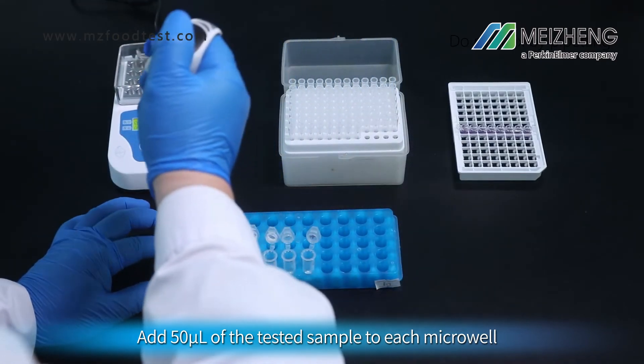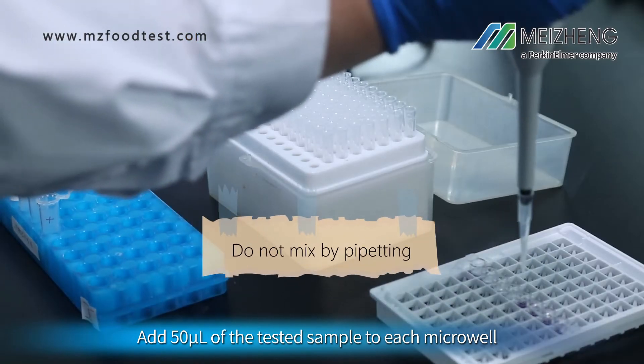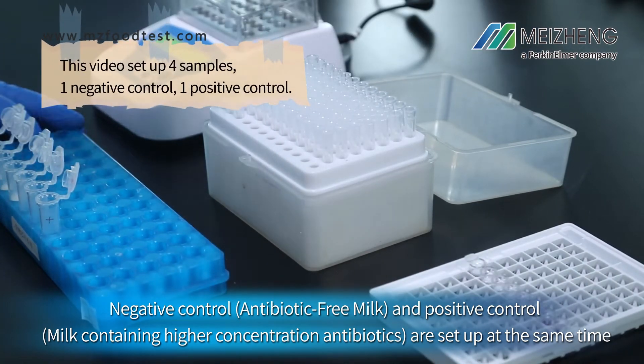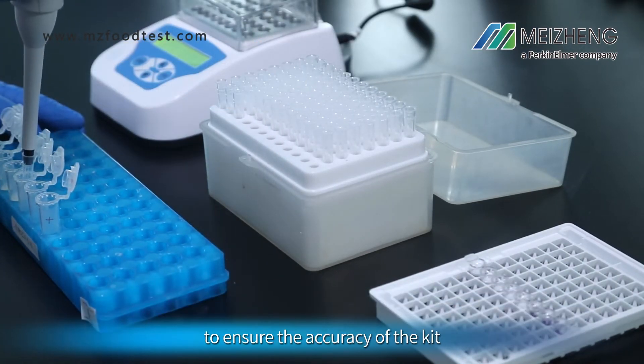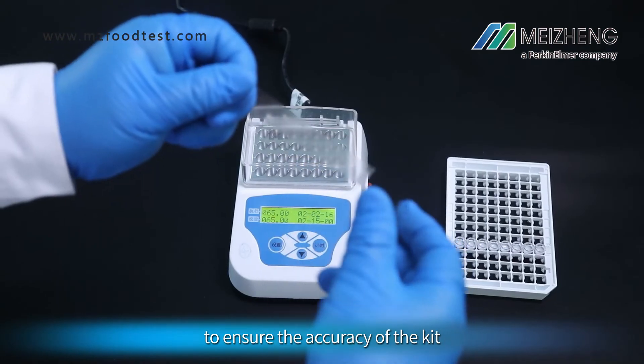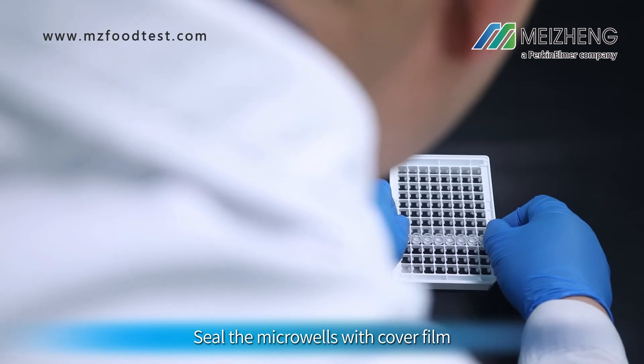Add 50 microlitres of the tested sample to each microplate well. Negative control and positive control are set up at the same time to ensure the accuracy of the kit. Seal the microplate wells with cover film.